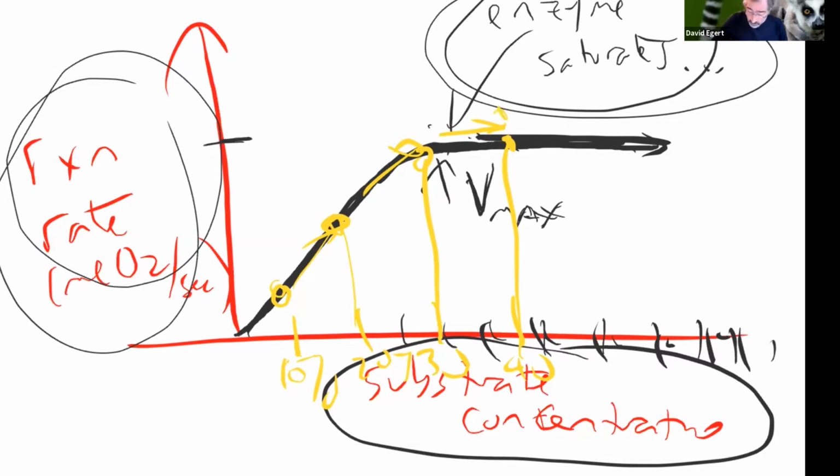It's still bubbles coming up if I'm looking at it, but the bubbles are coming up at the same mils of oxygen per second as they were at this, and then I go to like 50%, and still, it's not going any faster. So I know I'm at saturation.